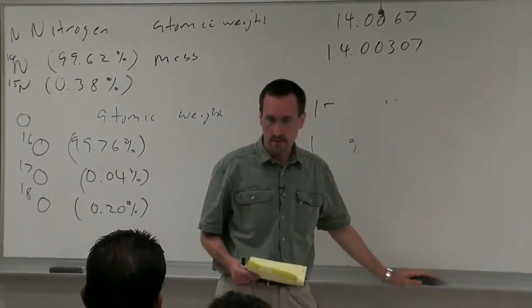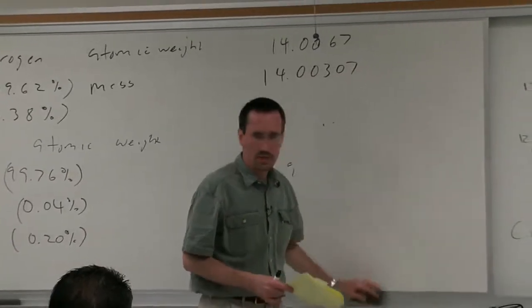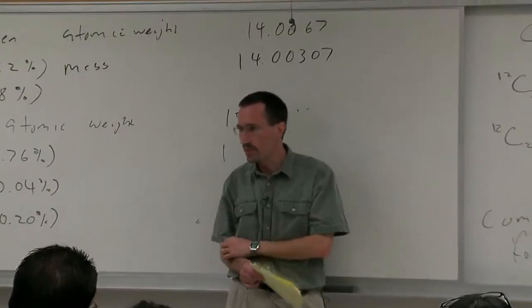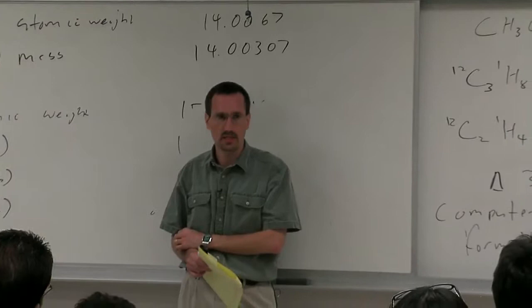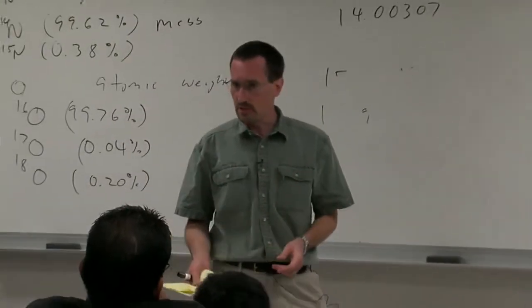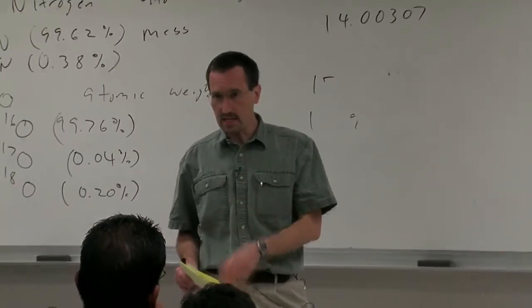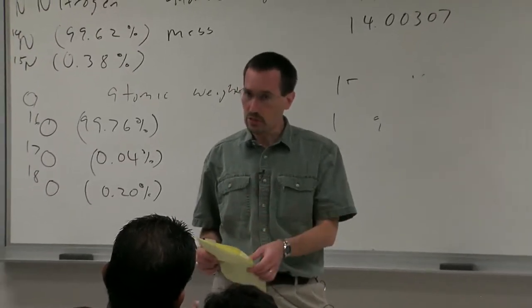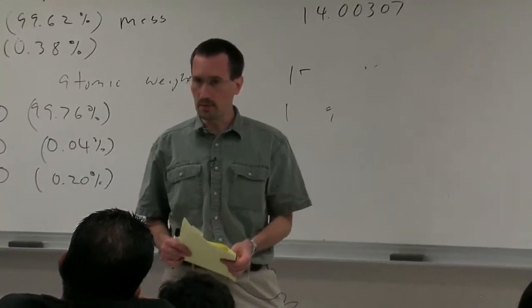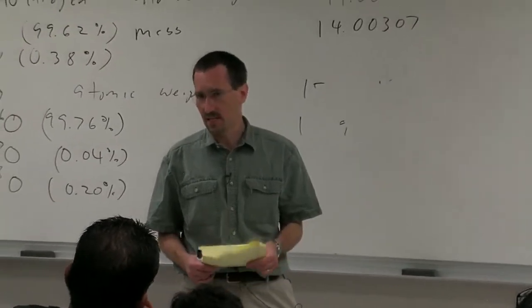So if you're doing positive ions, do you have to worry about adding the exact mass of sodium? Beautiful question. Well, you're in EI. So the question was, if you're doing positive ions, do you need to worry about adding the exact mass of sodium? Of course, EI mass spec also gives you positive ions, but there you don't add a sodium or a proton. But in the case of electrospray, you probably do have a sodium or a proton or a potassium on there. So absolutely, then you need to think about adding the exact mass of sodium or potassium or one more proton.